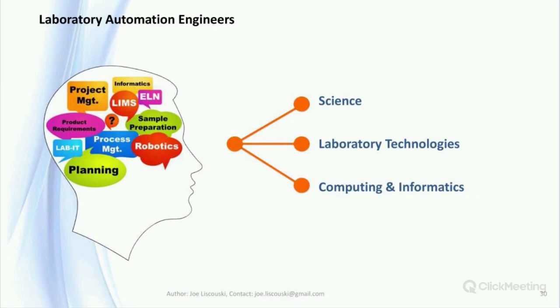Much of what we've talked about so far in this webinar series, including database systems, networking, and hosting, is common to computer science. A science background is useful in these discussions to understand the differences between lab systems requirements and similar applications in other fields. However, the need for a science background will become evident in the next webinar as we move into supporting laboratory experiments.